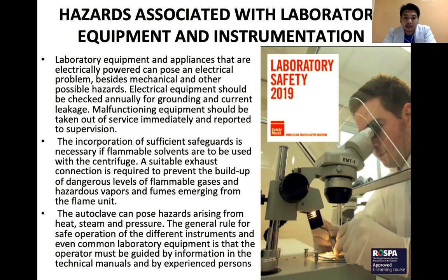So nagulat lahat kasi walang supervision ng senior or ng staff. I-close nila or inoperate nila yung autoclave without the supervision of a registered medical technologist. So what happens? Hindi na-close ng mabuti and then nag-burst open yung takip ng autoclave.